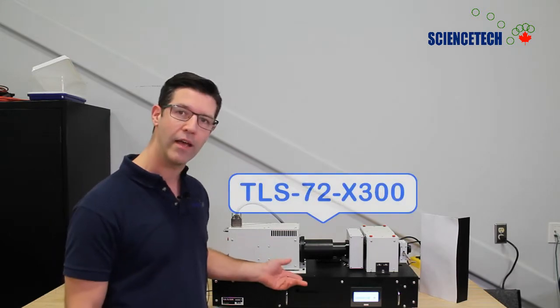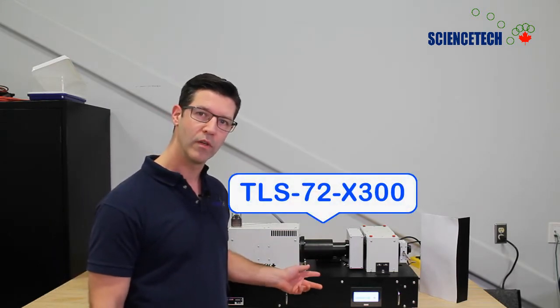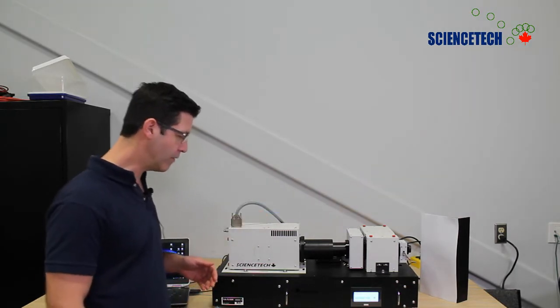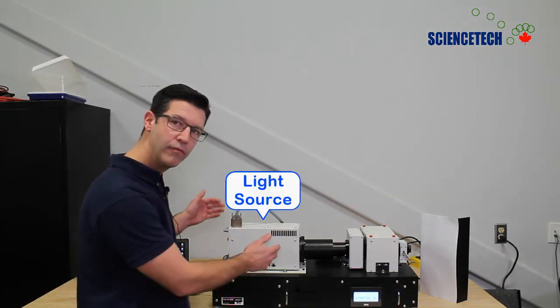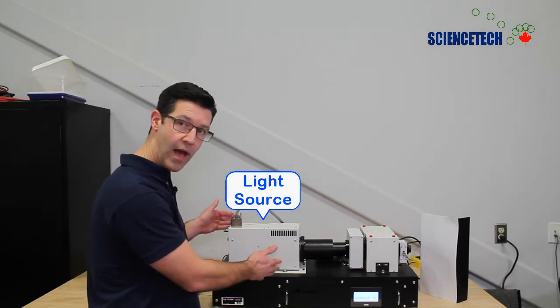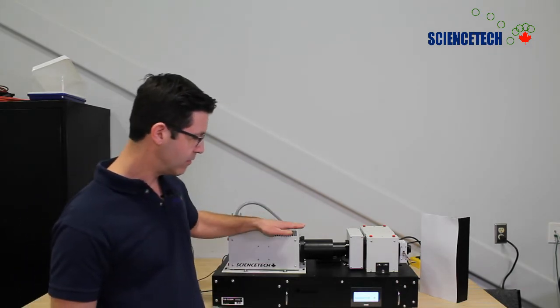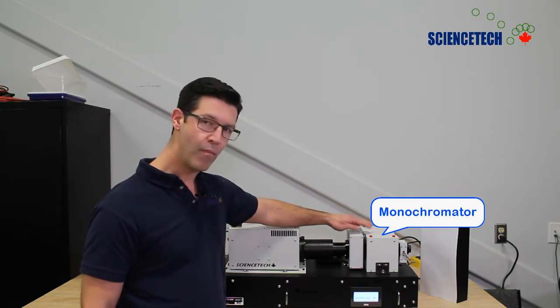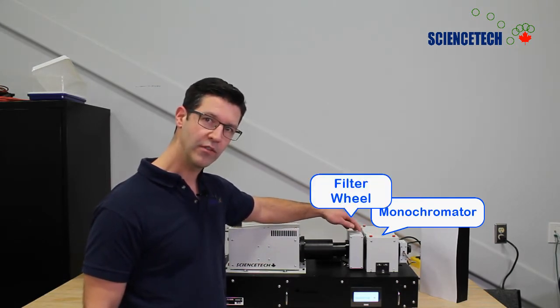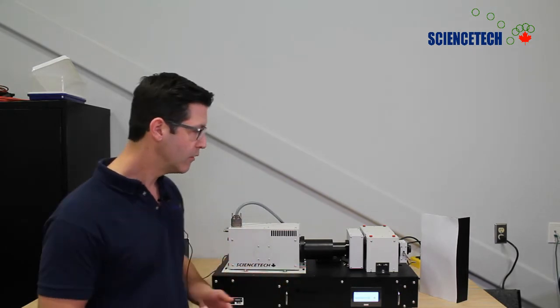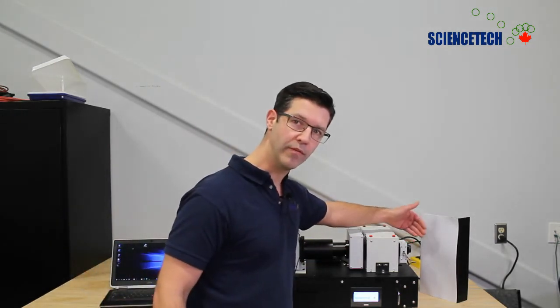We have a couple of models of these systems, but this one specifically is our TLS 72 with a 300 watt Xenon arc lamp. In this system we have a focused beam Xenon short arc lamp housing, and that system sends light into a monochromator and filter wheel system which separates the light out into its different spectral components so that you can make use of them here on the output of the system.